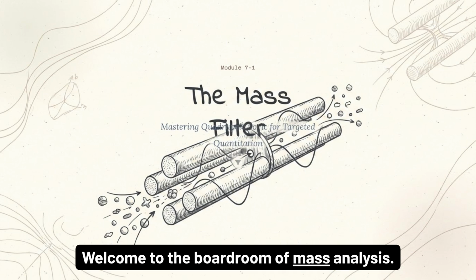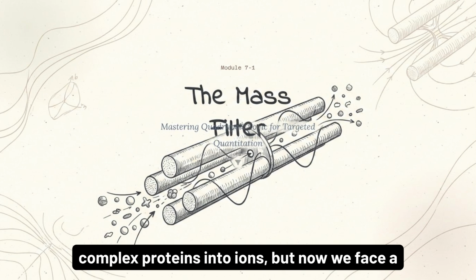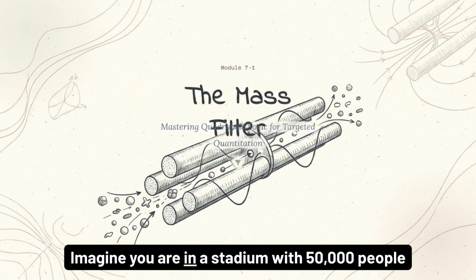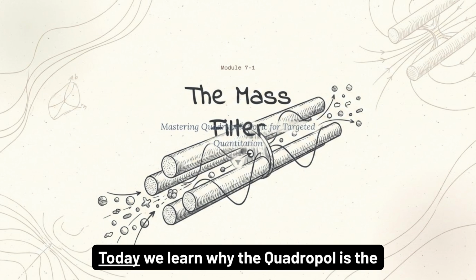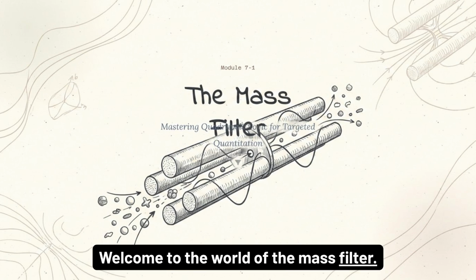Welcome to the boardroom of mass analysis. We've learned how to turn everything from complex proteins into ions, but now we face a massive strategic challenge: chaos. Imagine you are in a stadium with 50,000 people, and you need to find just one specific person. If you look at every face, you'll never finish. Today, we learn why the quadrupole is the ultimate gatekeeper. Welcome to the world of the mass filter.